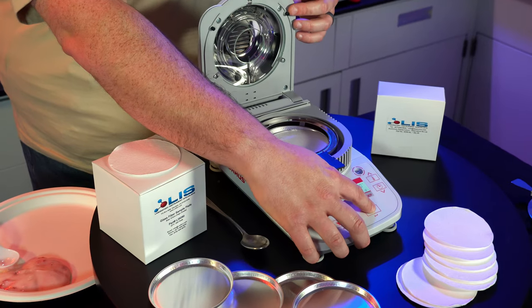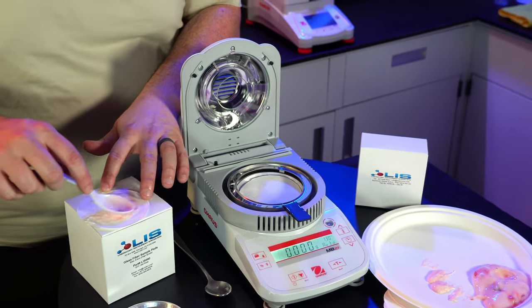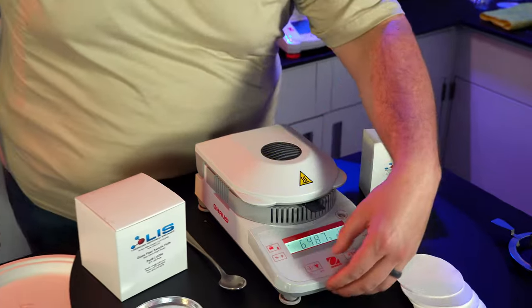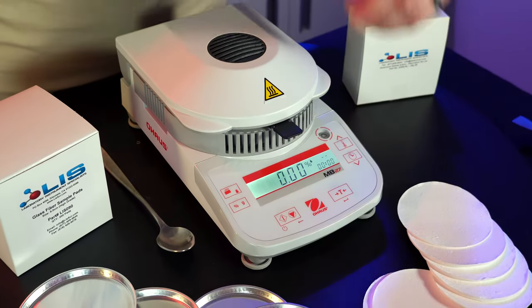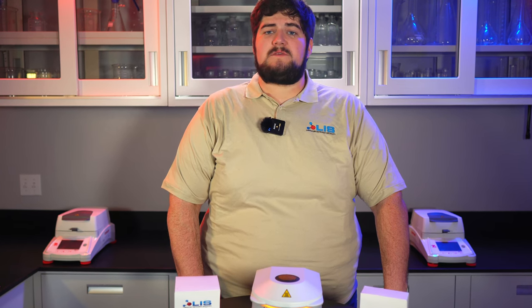We'll start with our usual pan setup and insert it into the scale. Hit the tear button to zero out the dish. Now grab your sample and spread the wet food sample product evenly on the glass fiber sample pad. Now close the lid and press the start button to begin the test. The test should take anywhere from 10 to 15 minutes depending on the switch-off criteria option you are using. Once the test is done, the results will be displayed on the front panel.